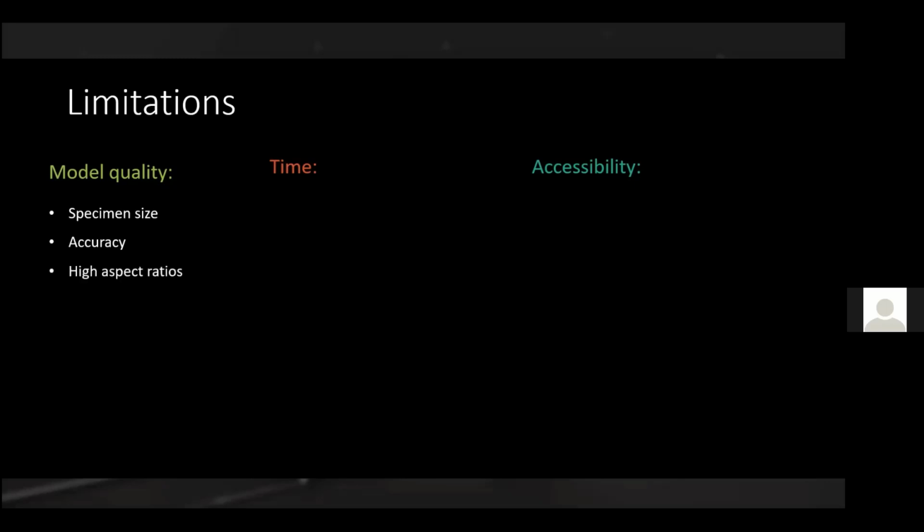Having said this, a classic example of where this becomes difficult, and we're quite possibly at worse resolution, are high aspect ratio structures. So something that is much longer in one or two dimensions than in the third dimension. Examples of this are proboscis that often are fragmented. Examples of this are wings that are planar. And here it can become difficult to pick up all the pixels correctly or to have the reconstruction process accurate. And then we can still produce good-looking models with some manual labor, but of course that's really not ideal if you want to do this at a larger scale, where you want to minimize any manual labor that might be required.